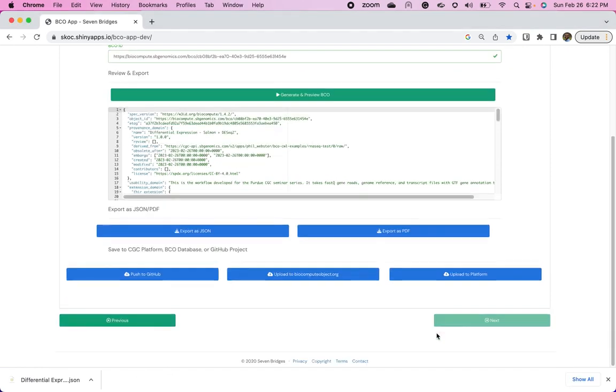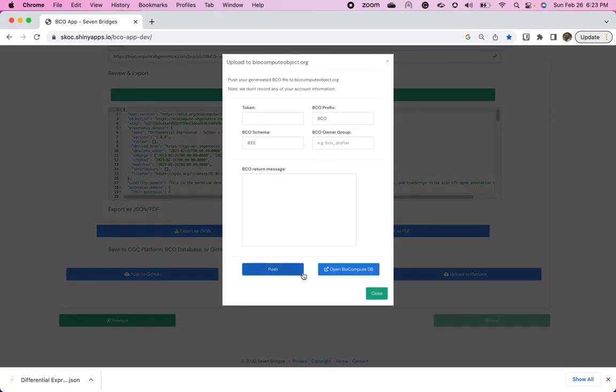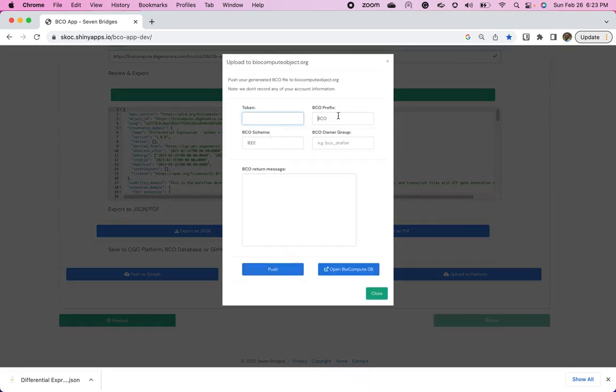You can upload to one of our platforms, such as the Cancer Genomics Cloud, where we have a lot of publicly available workflows that a lot of researchers use for their own analyses. They also create their own workflows, which really makes this tool even more helpful for them. Or you can upload directly to the public biocompute object org website. And so what you need is you have to have a token, BCO prefix, and we're just going to use BCOdrafter.